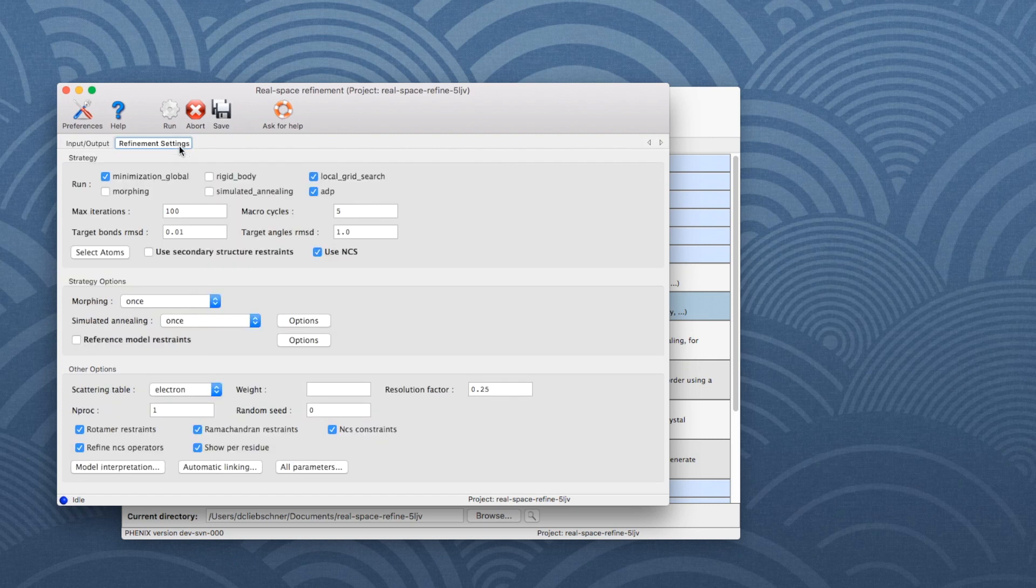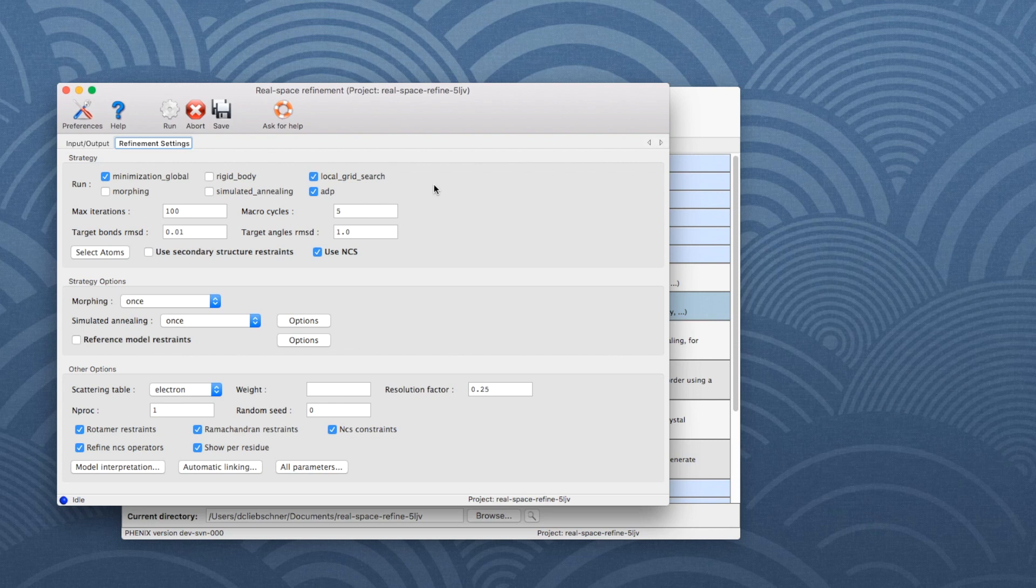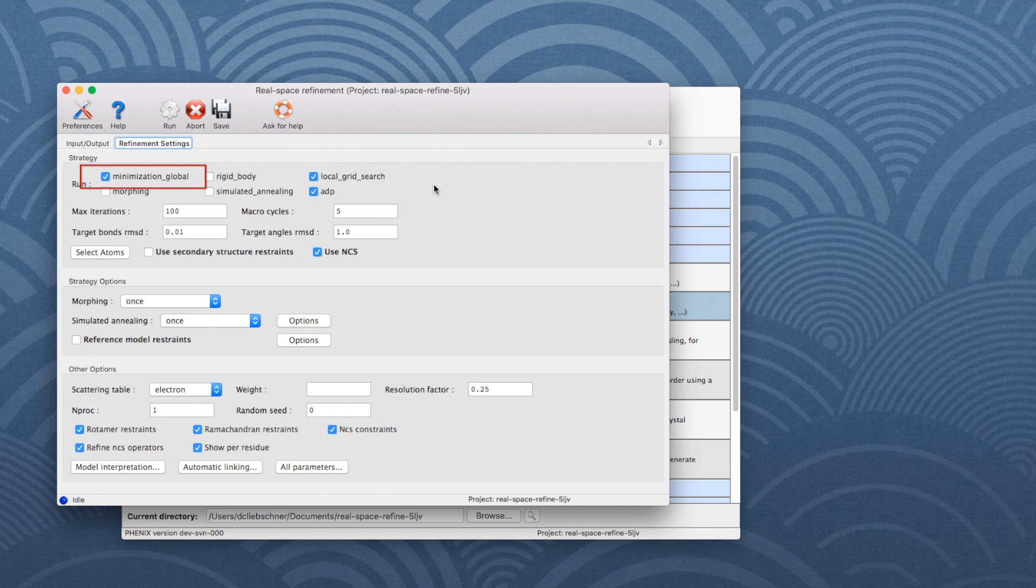Then go to the Refinement Settings tab, which contains most of the essential options for running RealSpace Refine. The following refinement strategies are enabled by default: Global Minimization, ADPs, and Local Rotamer Fitting.